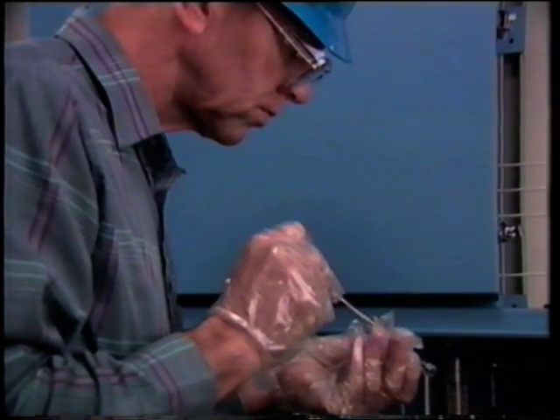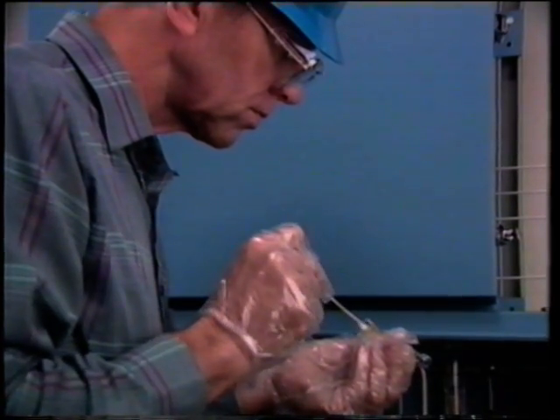Clean or replace the flow rate indicator according to manufacturer's instructions.